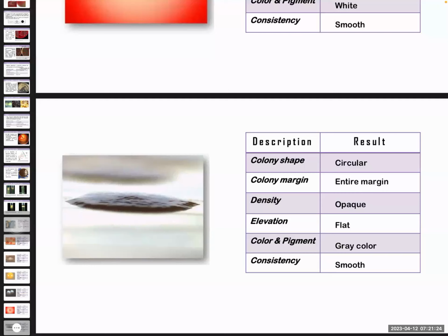So for example, small circular creamy colonies. Ganun na lang. Na very basic. Kung ano yung makikita mo, yun na lang talaga. Hindi na nila describe si the density, si margin, si elevation. They just simply tell what they can readily observe. And again, that includes the color and the size of the colonies.